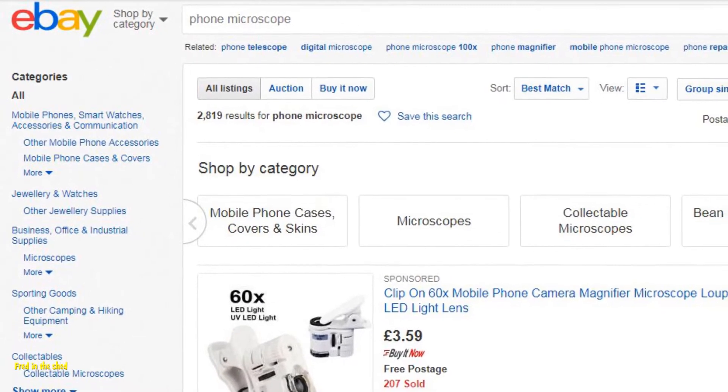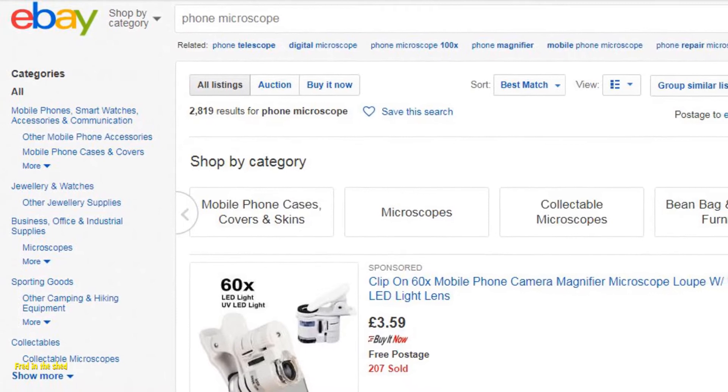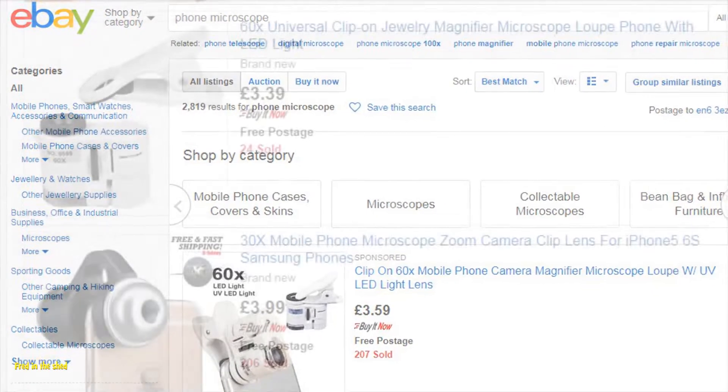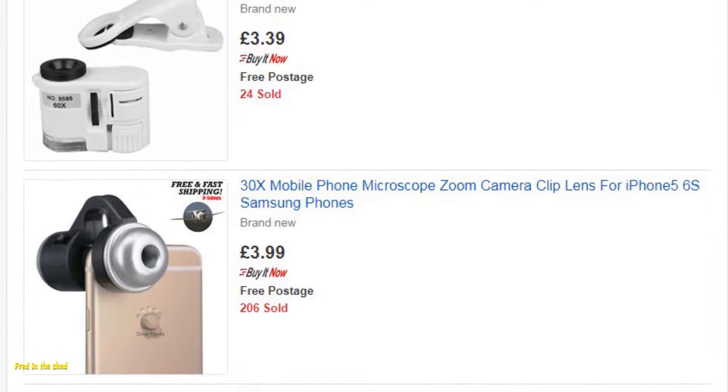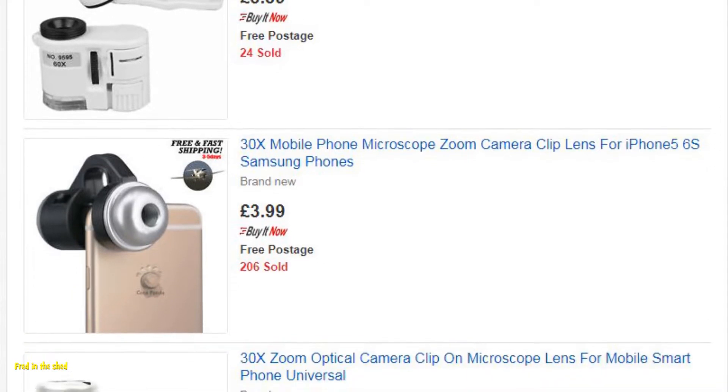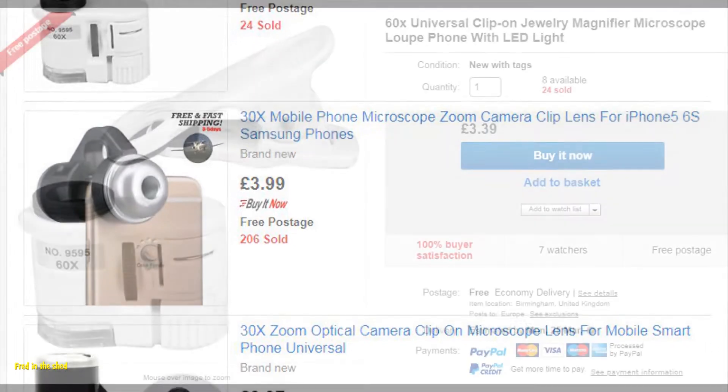So I thought about one of these little microscopes that you can connect to the camera on your phone. Sure enough, when you go on eBay and have a search, you find out you can pick these phone devices up for about a tenth of the price of the big one.